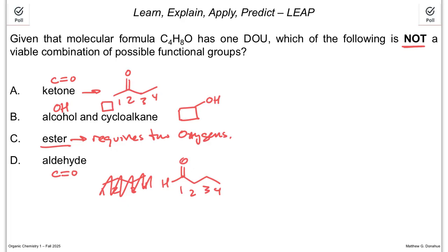So even though they both have carbonyls, that little bit of variation, if you're looking in the right spots, will tell you the molecule has an aldehyde in it, or if it doesn't have the specific signature, it's got to be a ketone. And so then you can narrow down from the possibilities of carbonyl versus alcohol to one sort of functional group.